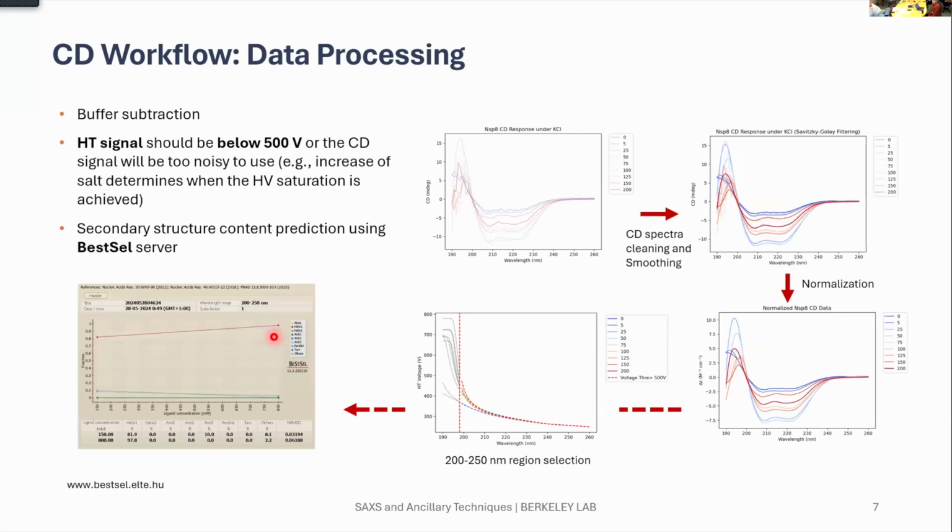Now about data processing. We're getting these not-so-nice curves the first time. These are spectra, so they need some processing. In CD, there are several steps in data analysis, and I'll quickly show some of the main ones. First, we want to clean our CD spectrum by subtracting the buffer, so we know that the signals we are receiving are not from buffer components, but solely from our protein.